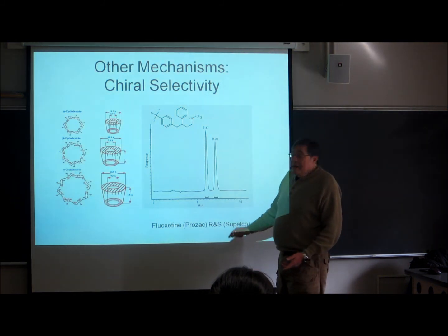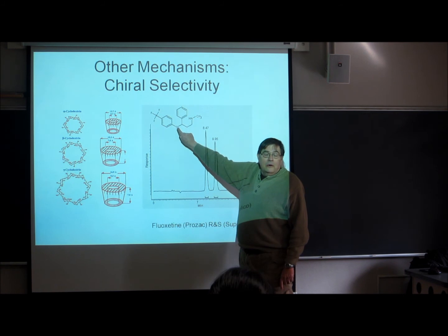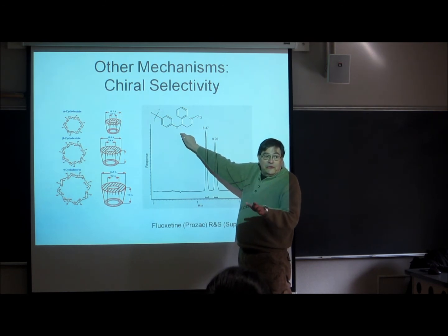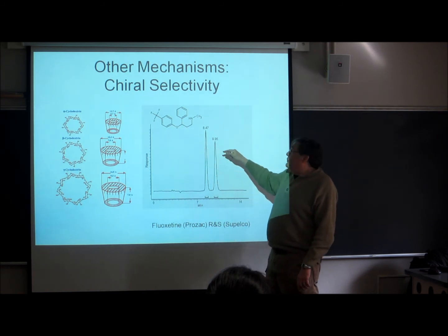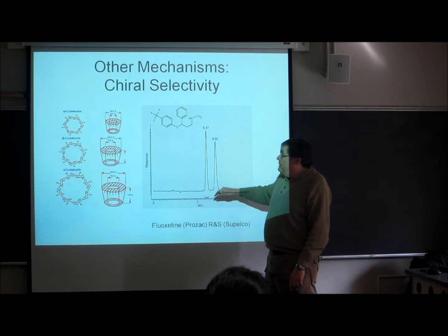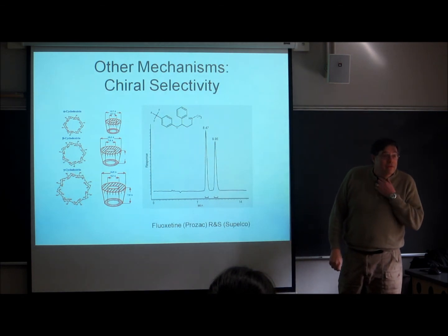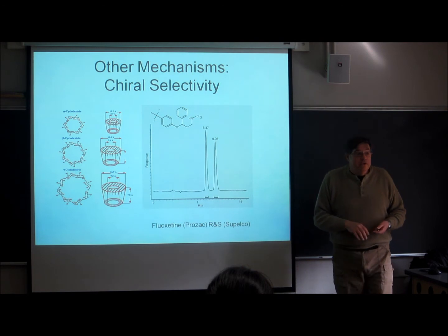So if you can't find a way to synthesize only the R or only the S isomer, that's where Tom Hoye and the organic chemists come in, because they learn more and more about how to do the specific stereochemical synthesis. If you synthesize both of them, you have to use some preparative chromatography method to separate them before you put them into a pill so that you have them in the right form. Right? This is a very important use of preparative LC in industry. Extremely important.